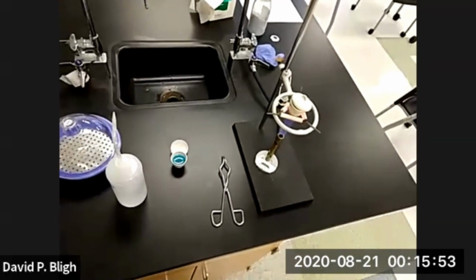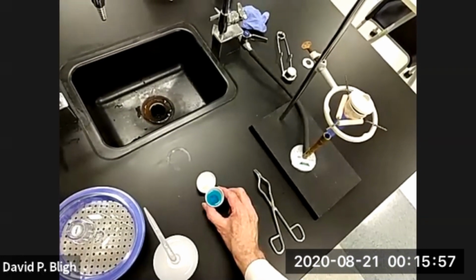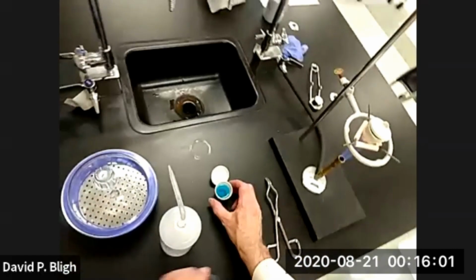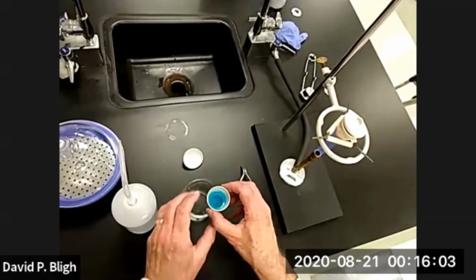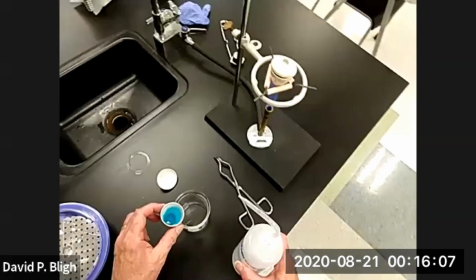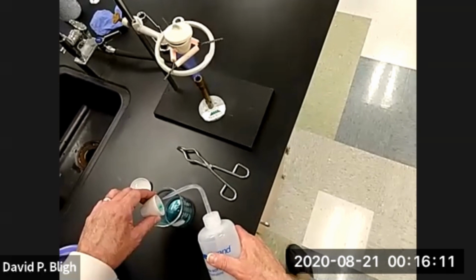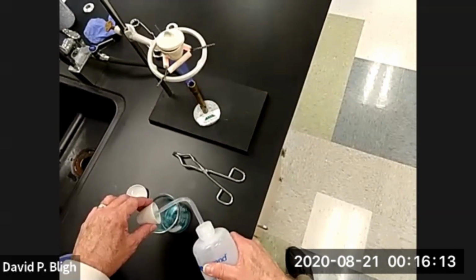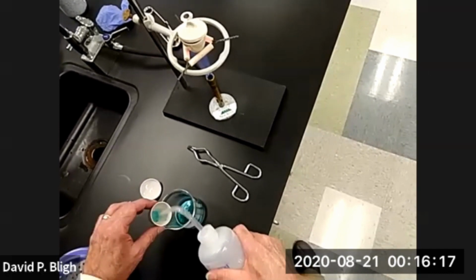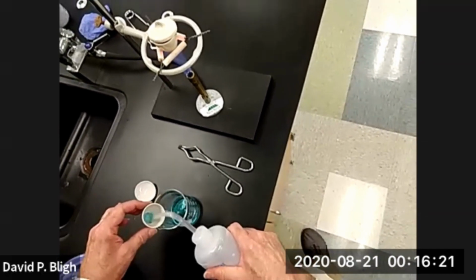All right. Okay, that's cooled off. Now we're going to use this as our waste container. This is copper sulfate. We don't want to put that down the drain. Okay, there's a little bit. Let's see how much we can get out with just rinsing. We don't want to have to scrape it. Although we can if we need to.